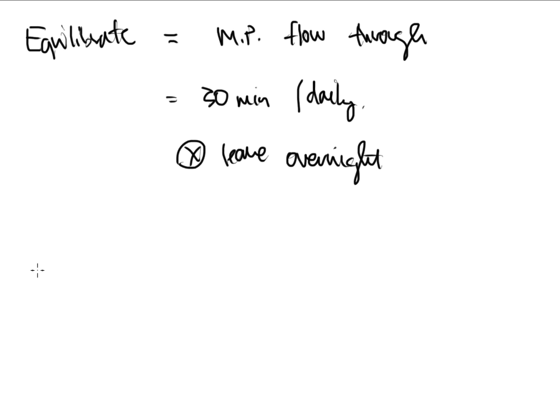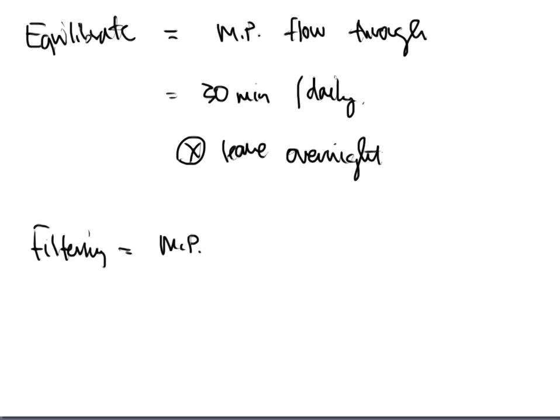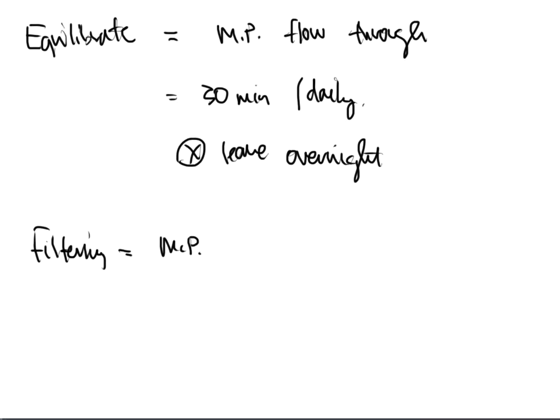The other thing that I want to say is this concept of filtering the mobile phase. Some people are real particular with this, and some people are not. Quite honestly, we don't really filter our mobile phases on the IC instrument. We probably should, but we're not using nasty things and nasty mobile phases, and for us, we typically make them fresh, and they dissolve very well. There's very small amounts of things, and we just don't really filter them. But it's a very good idea to do it.